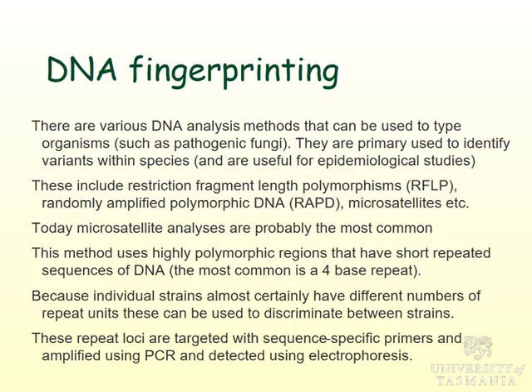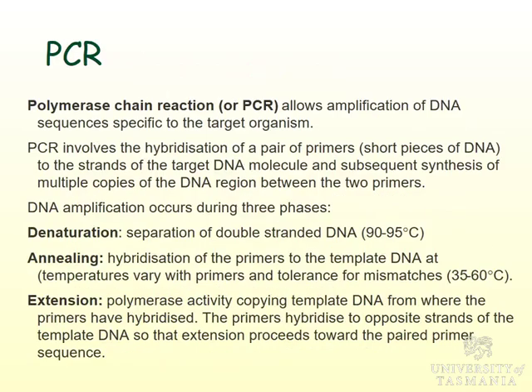So these microsatellites can be useful. Once again, you just look at the size of those repeats, and use that to determine which strain you're dealing with. Let's move on.